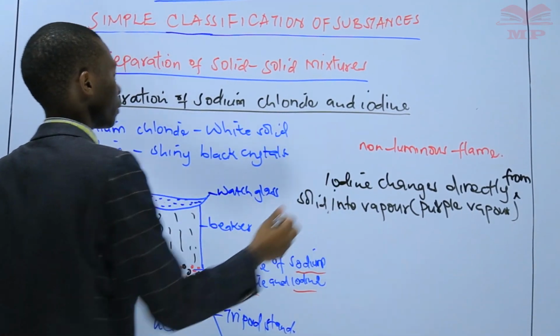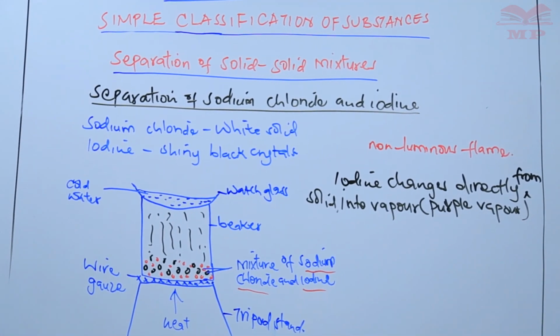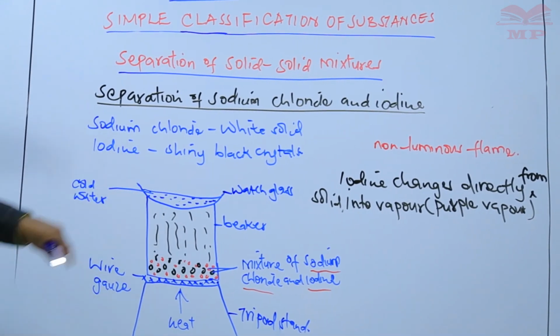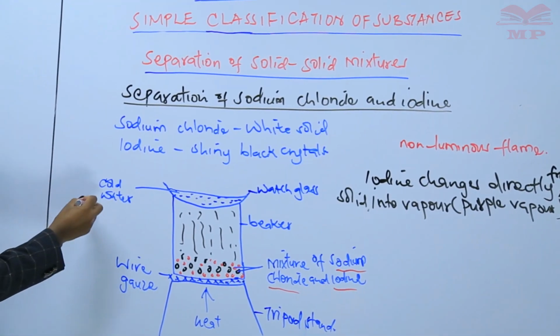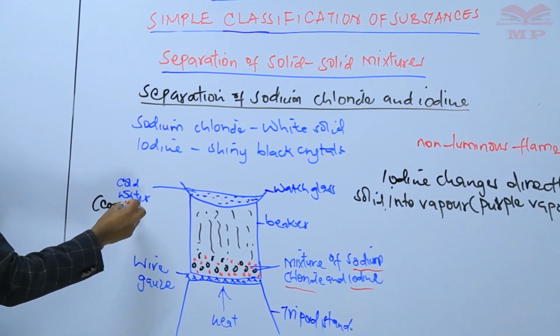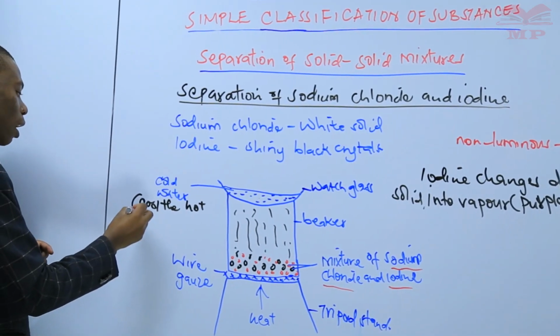The function of this cold water, which is held by the watch glass, is to cool the hot iodine vapor.